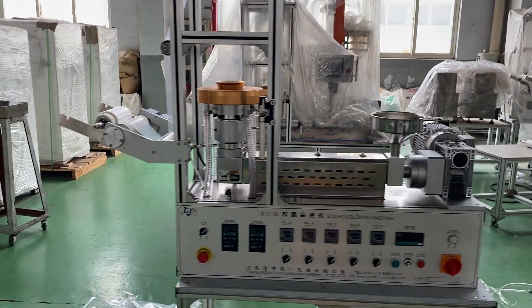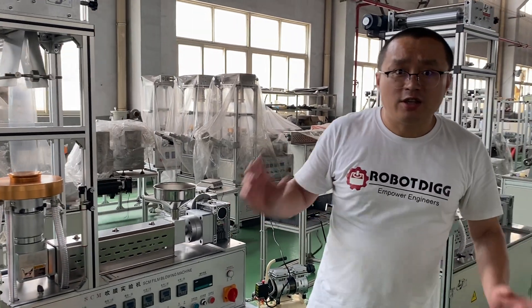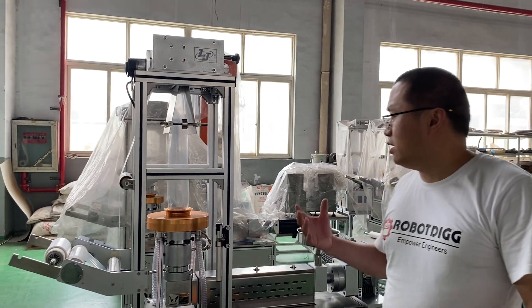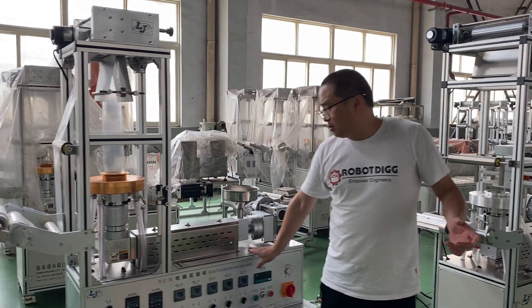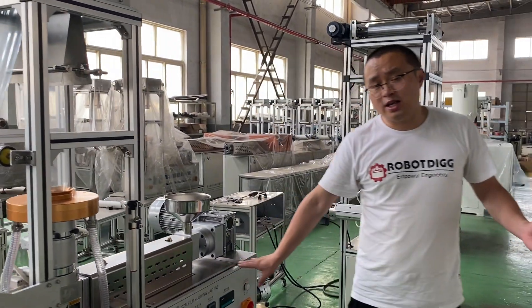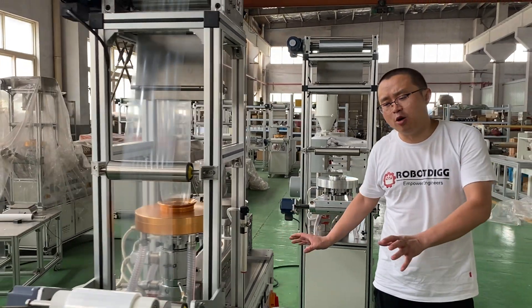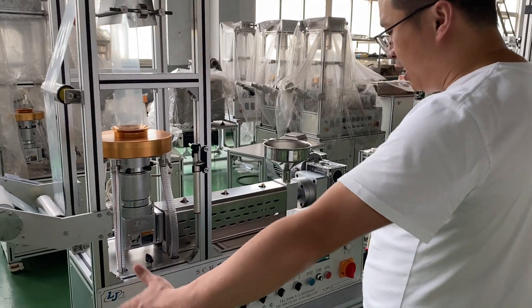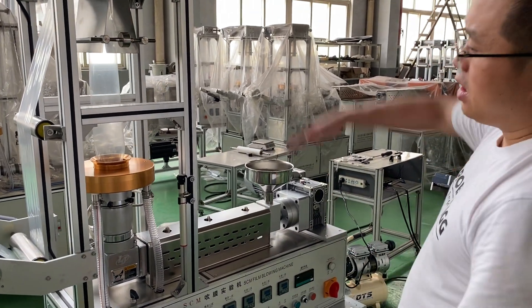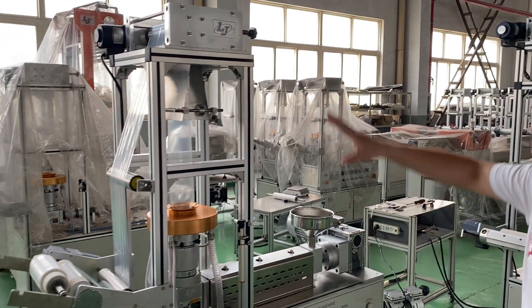We have seen the blow film machine before. The difference is that the performance of the cast film machine is much better than the blow film machine. For the blow film machine, we have a model called SCM 20, which can be put on a desktop. The size is just about less than 1.5 meters and the height is also about 1.5 meters tall.